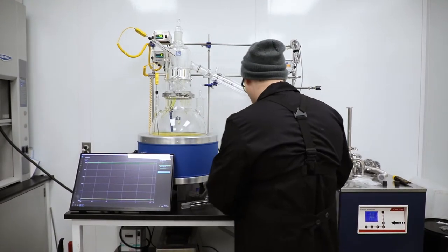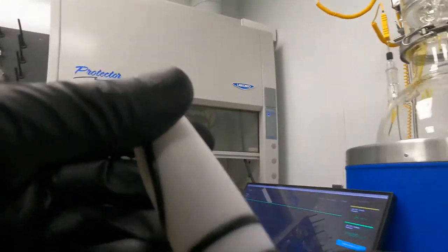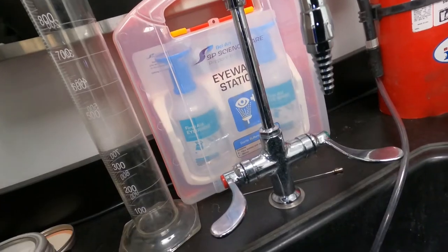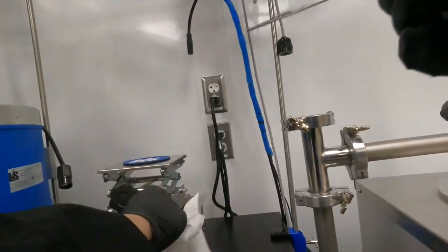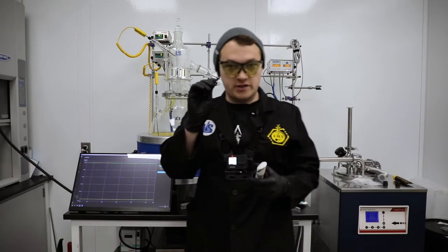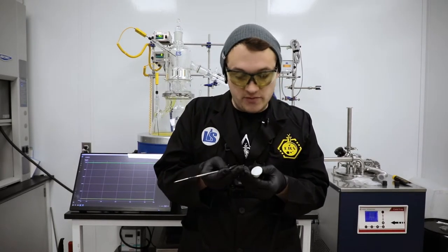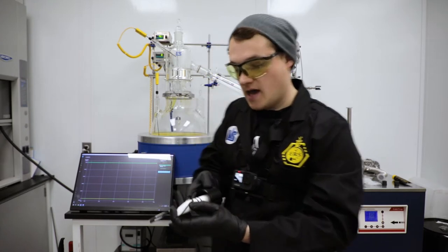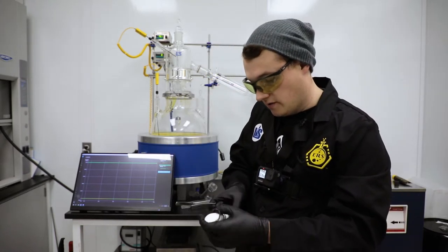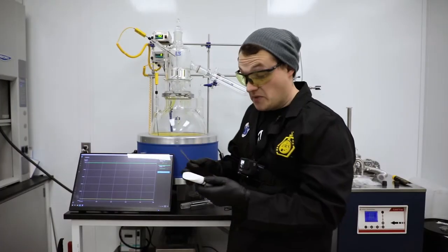I'm going to set my glass down and inspect this. It looks like it definitely needs to be cleaned. I'm going to grab a spatula — it's the best tool for this because I can get in here without breaking anything. We want to be careful not to damage the PTFE. I'm going to go in from the side and get the o-ring unseated, then run my finger around and pop the o-ring out. It definitely needs to be cleaned — I can smell it.